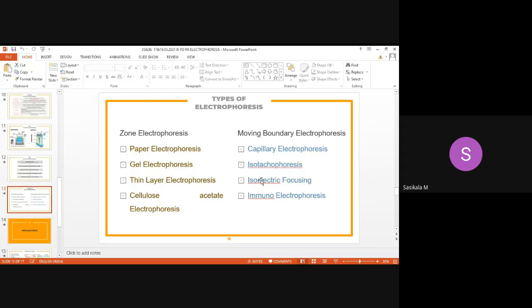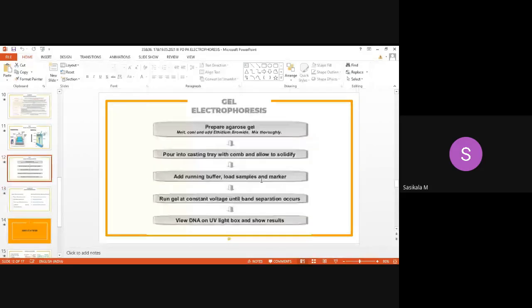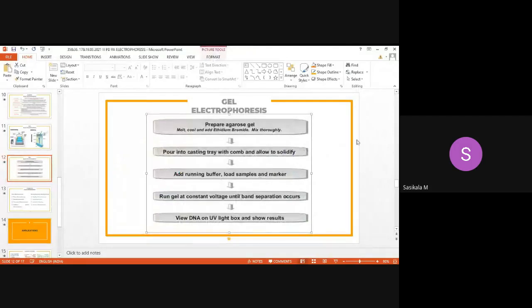On applications of gel electrophoresis, pharmaceutical applications of gel and paper electrophoresis. Make a tabular column of what contents you require: the stationary phase, what gel is used, what mobile phase is applicable, any voltage range, and the detection parameter. Make this as a tabular column for at least 10 samples for gel, and 10 samples for paper.